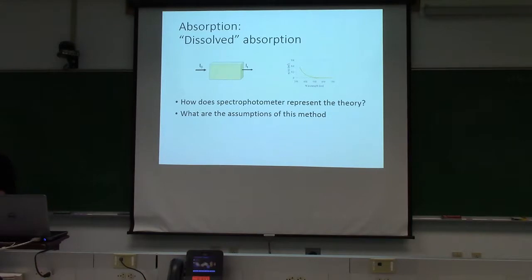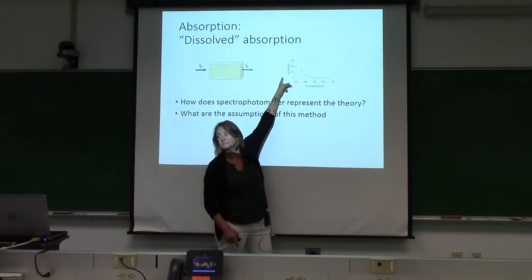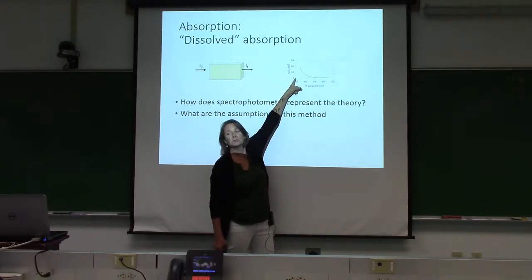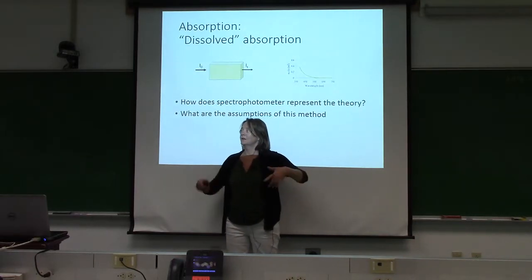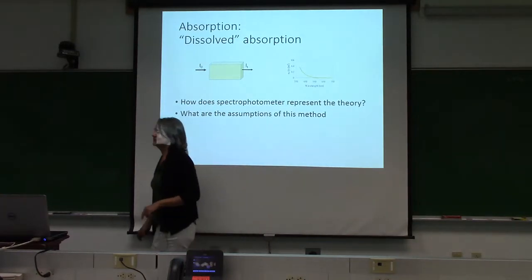Right? And also when you scan, we set our spectrophotometer to scan from red to blue so that you're increasing the energy of the light as you're measuring it. If you started at this end, you could be bleaching your sample as you're measuring it. And so then you would get a steeper slope because it's being bleached and lowered as you move to the lower energy red wavelengths.